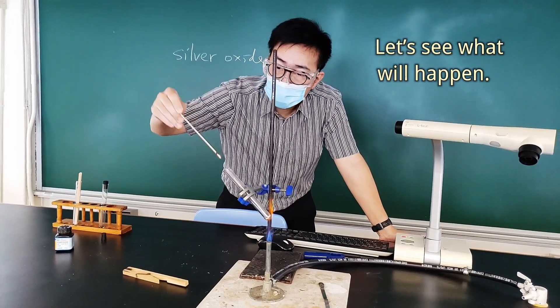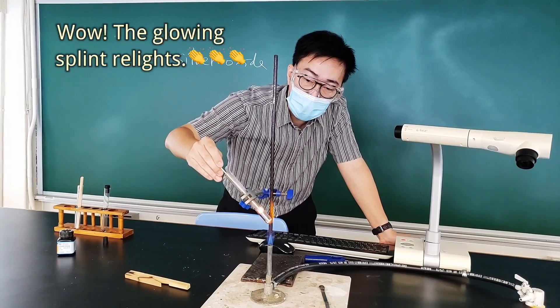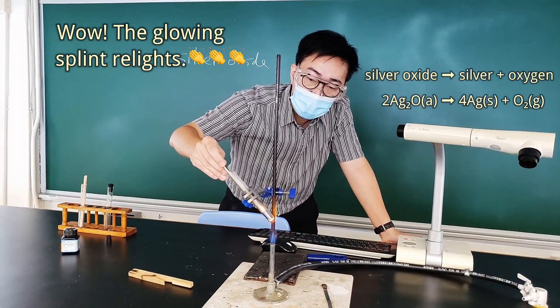Okay, so glowing splint. What do you see? The light! Wow, wow, so happy. You see, so happy. You can see the light. Yay!